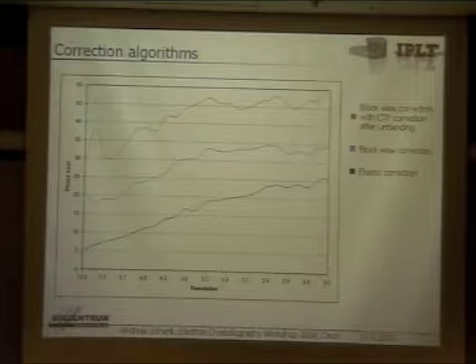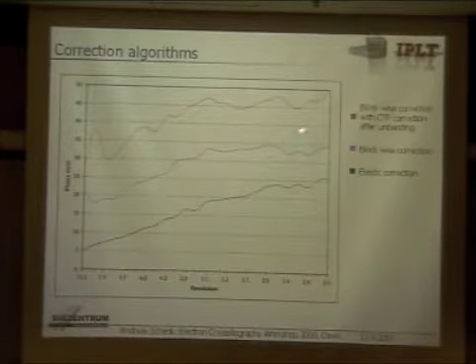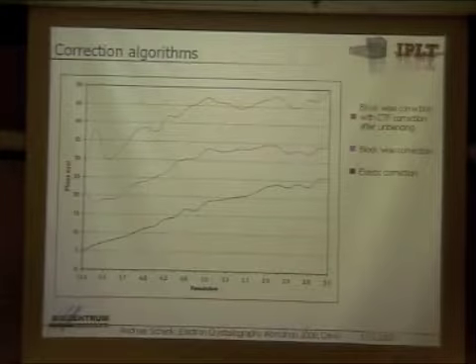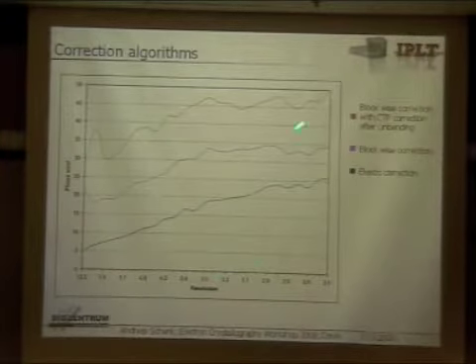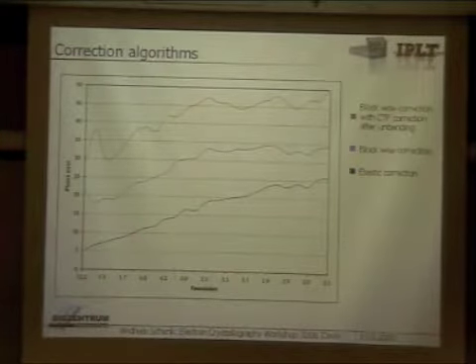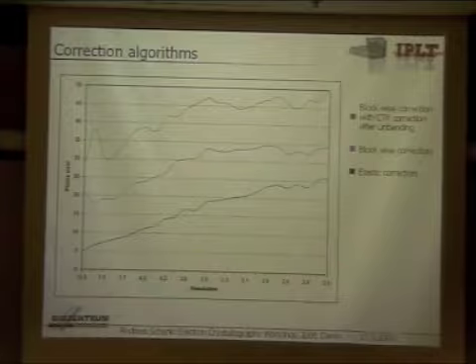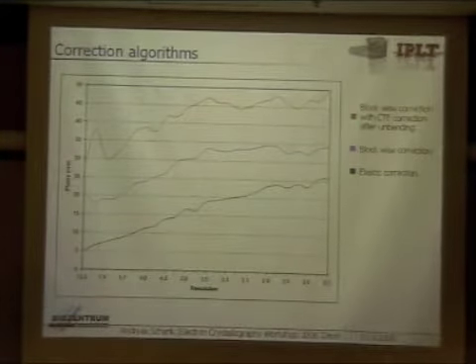Okay, so that's in a way the final message, from the way it's implemented now to the optimal way to do the distortion correction. I think there's a considerable gain you can have. As I said before, for a very good crystal it probably doesn't matter that much. But if you start processing bad crystals and want to get as much out of it as possible, then these things start to be important.